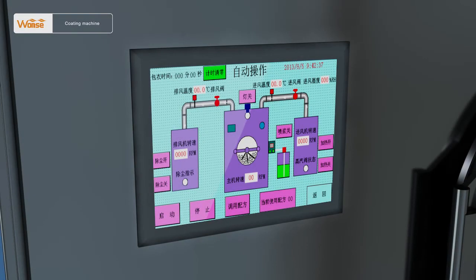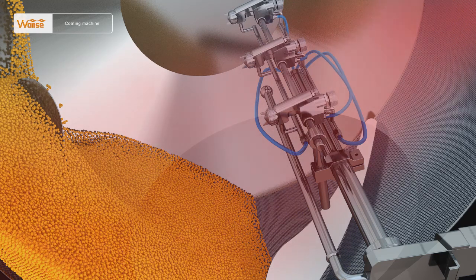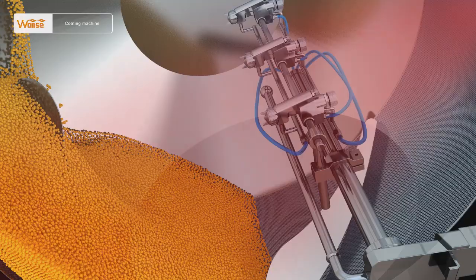Second, preheating of tablets or pills to be coated. Start the hot air, air exhaust, and main machine to preheat the tablets or pills to be coated from 38 to 45 degrees Celsius.